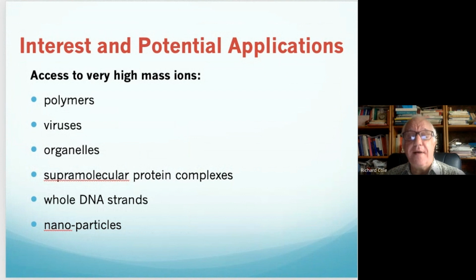There's also a lot of interest in biological applications, looking at high mass species like viruses, that you can't really see easily on a conventional mass spectrometer. Organelles, also supramolecular protein complexes, whole strand DNA, and nanoparticles.